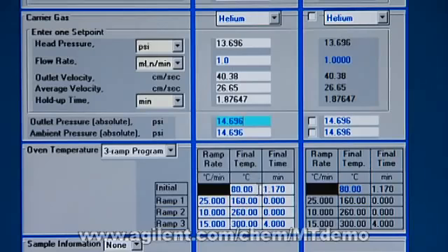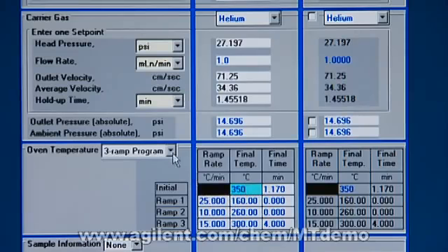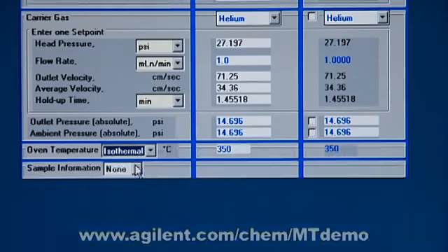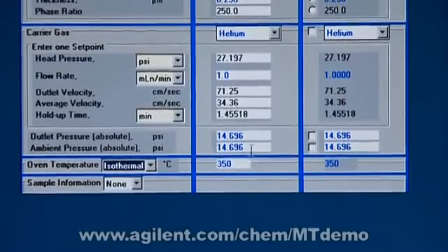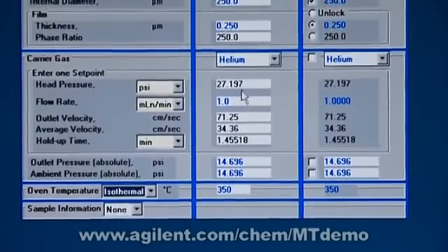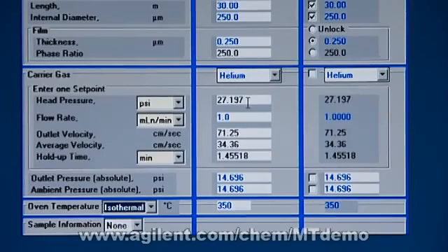I'm about as hot as you want to take a DB1. And I'm just going to click on isothermal here so we don't get confused on this stuff. So 350 degrees at 1 mil a minute costs 27 psi to drive that flow.